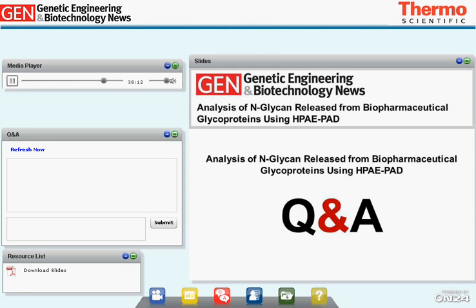What amount of N-glycans are you injecting for the HPAE-PAD analysis? Thank you, John. Usually we're injecting about 100 to 400 picomoles, but this depends mainly on 2 aspects: the quality of your HPAE-PAD system and the consumables. That means, for example, when you're using a new 3 millimeter gold electrode, and on your glycan sample.